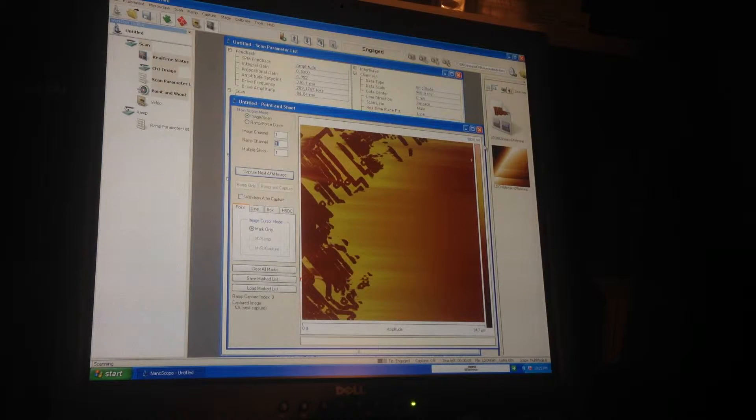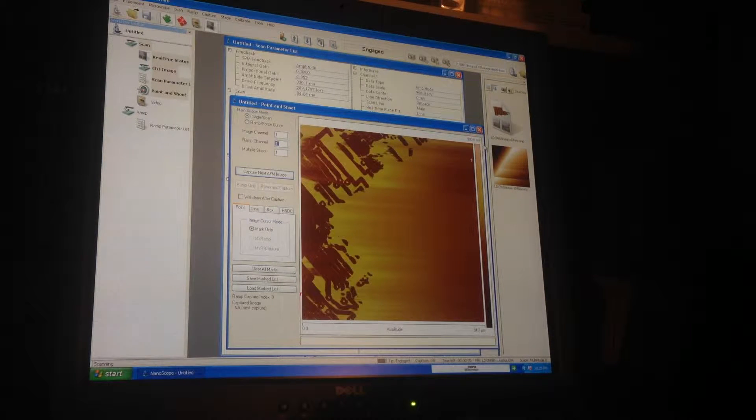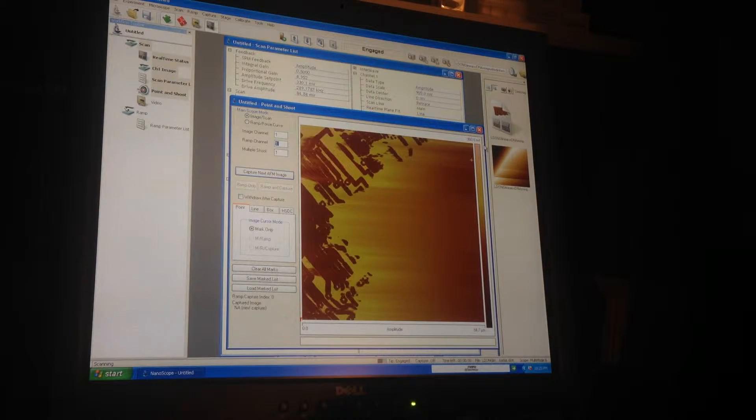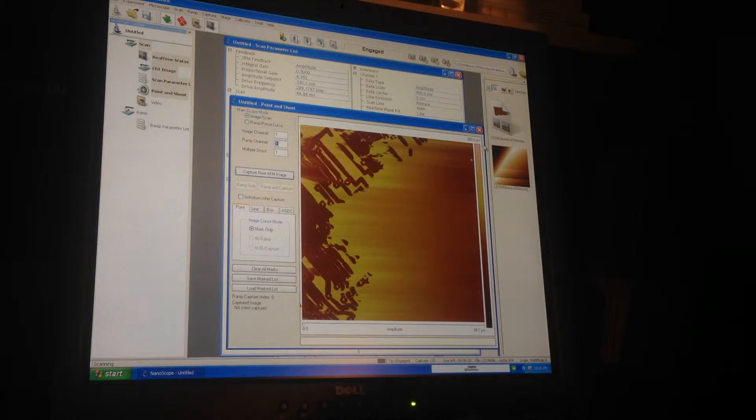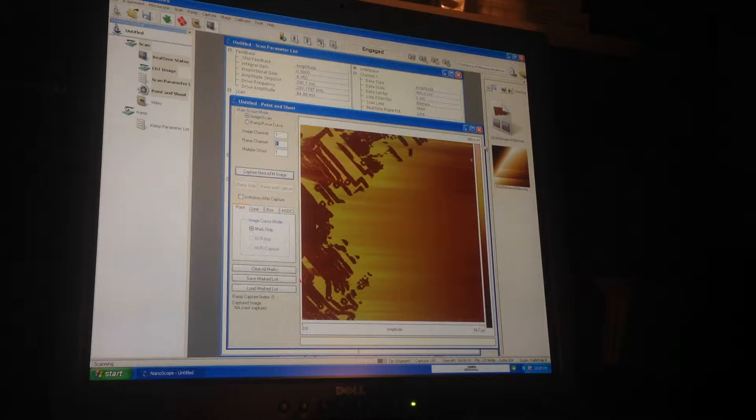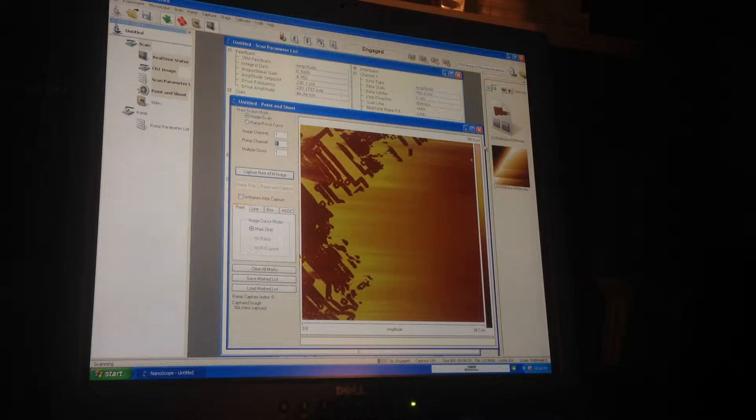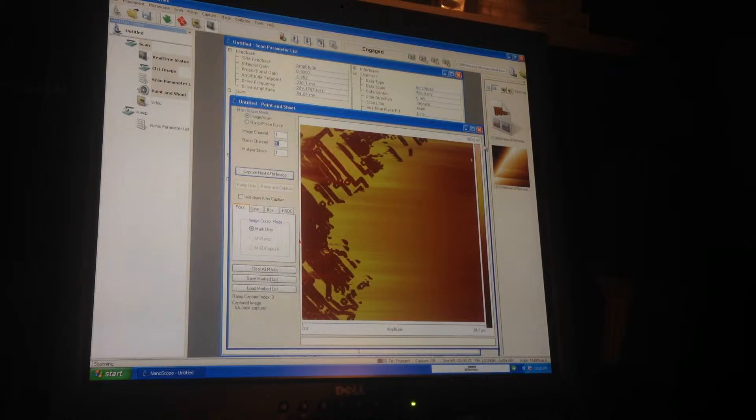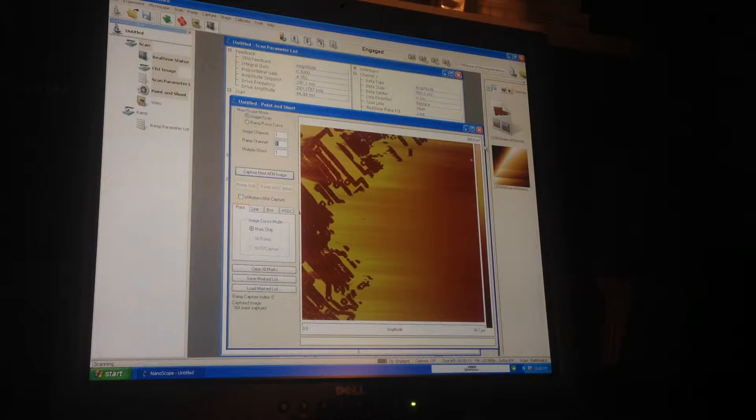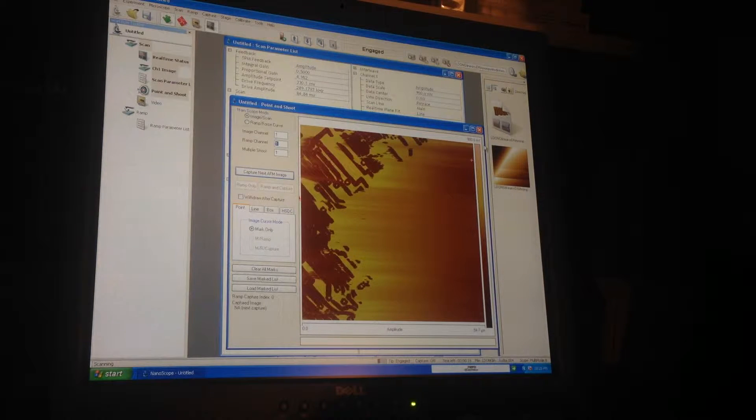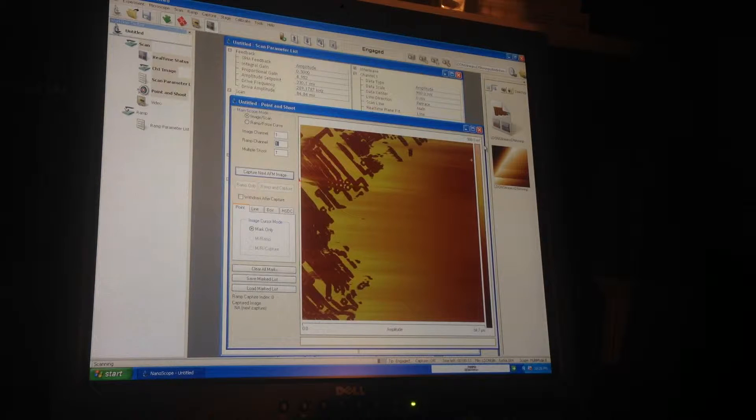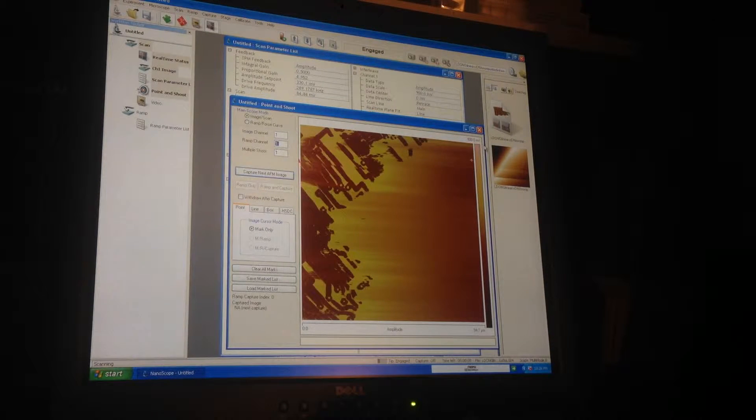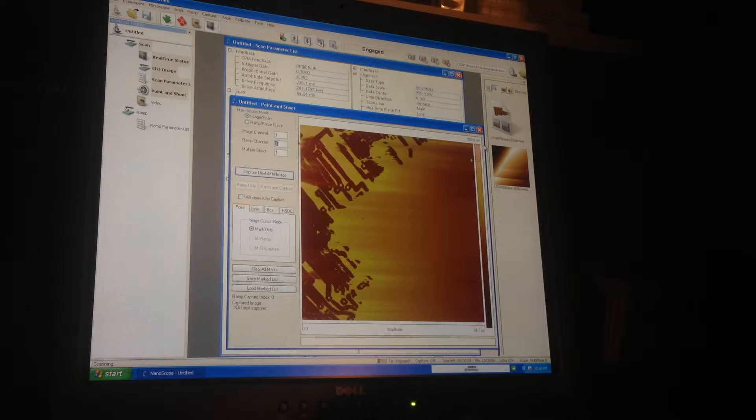I don't have any calibration standards or anything like that, so what I did is I bought some cheap scrap wafers off eBay. I figured they might be useful for a bunch of calibration applications including looking at them through an electron microscope that I have with some friends out in Japan and for looking at stuff through an STM. The idea was that they'll have probably a range of feature sizes, hundreds of nanometers to micron-sized features on them, which is kind of what I want to have.